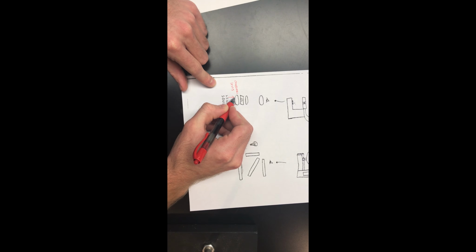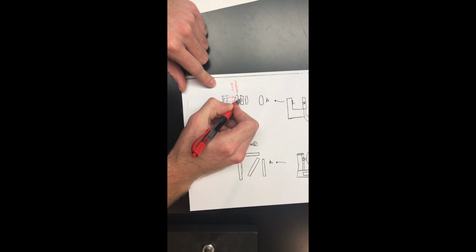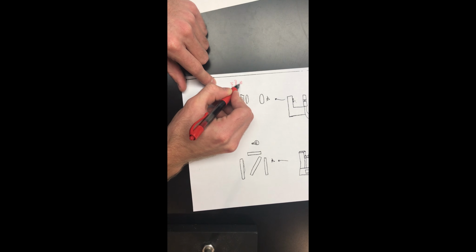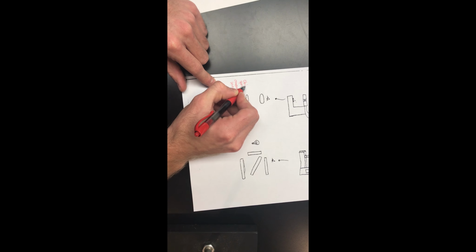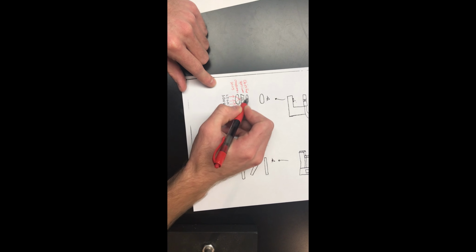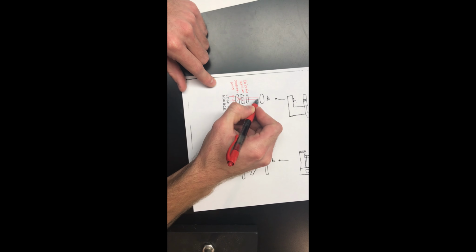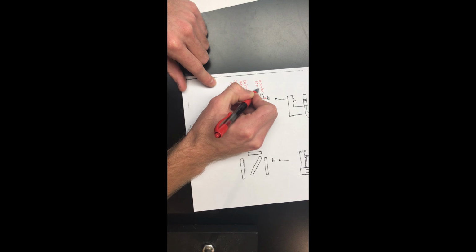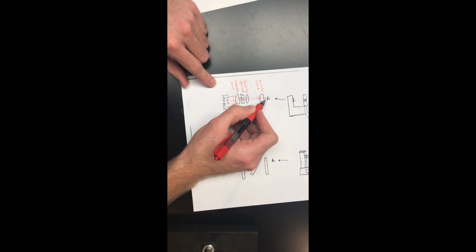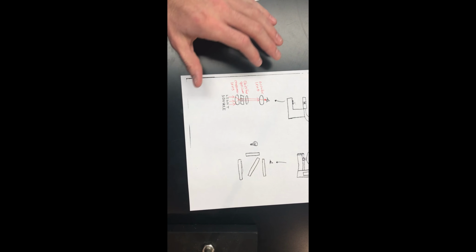That condenser lens is going to condense the light, shine it through the specimen, and then it's going to pass through the objective. After it passes through the objective, the light is further condensed through the ocular lens, and that image is portrayed. That image portrayed is what the viewer sees.